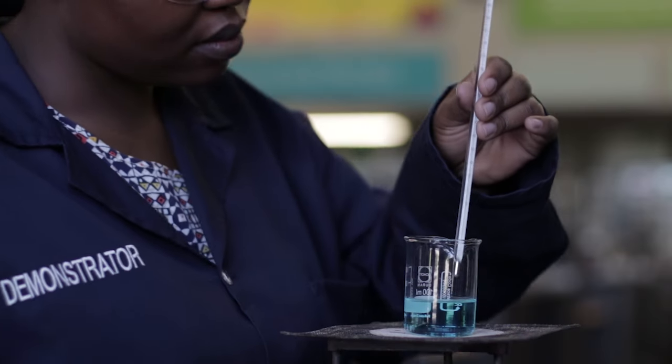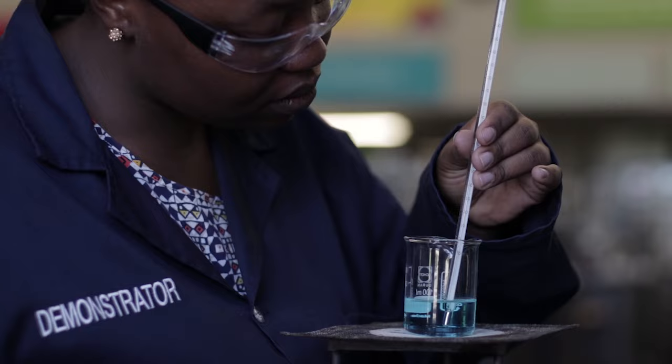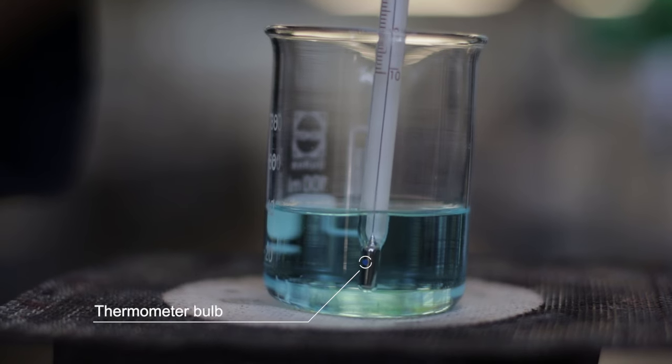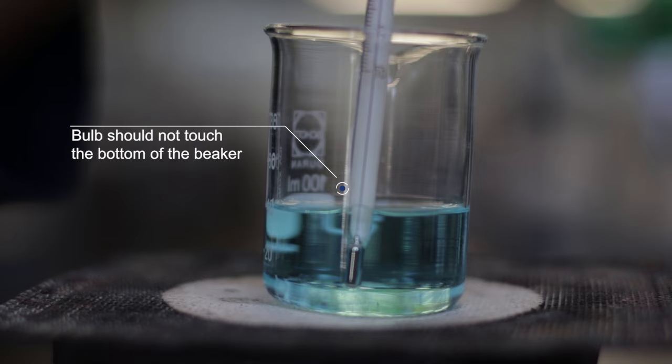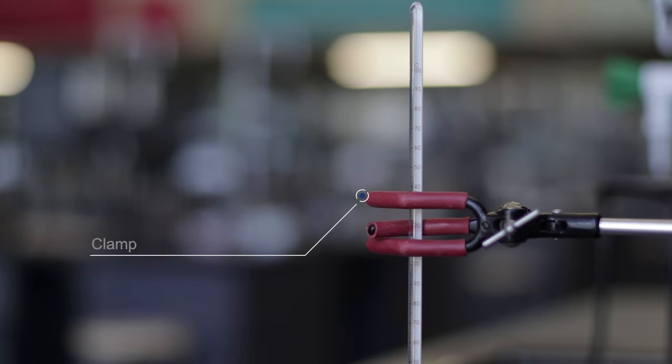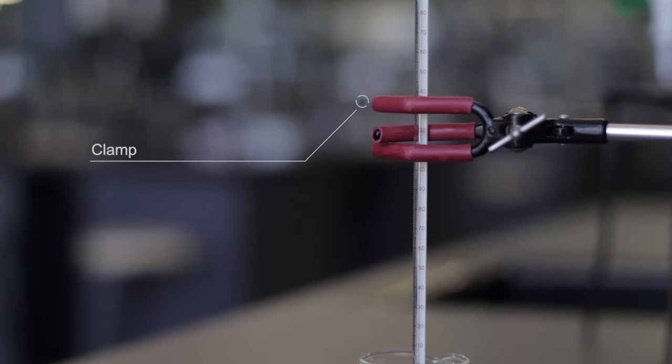A thermometer measures the temperature of a solution. The bulb of the thermometer should be immersed in the solution and the bulb should not touch the bottom of the glassware. If needed the thermometer can be secured with a clamp.